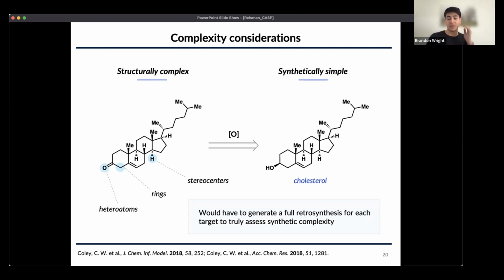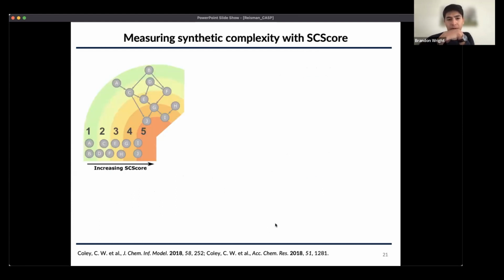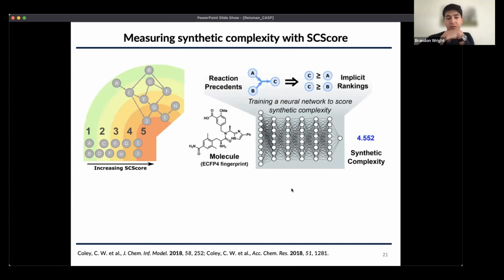And even further, this has to be validated in the laboratory to decide, okay, this compound takes 6 steps to make, this compound takes 5 steps to make. And that defeats the purpose of trying to decide which disconnection is best if you have to actually go and make each precursor to evaluate whether this is the synthetically least complex direction. And so one of the ways that's been developed around this is to use estimation tools to guess how synthetically complex something is.